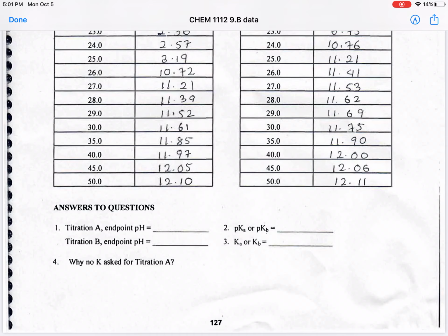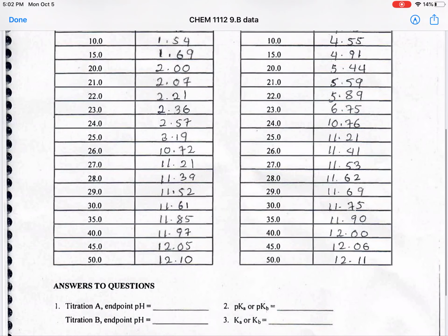Whereas a weak acid or a weak base is partially dissociated. You will also find undissociated acid or undissociated base. So for those we can write and find the K, which is the acid dissociation constant, because it's a partial dissociation, whereas for a strong acid and strong base, there is no K. Okay, so you can explain that for question number 4.